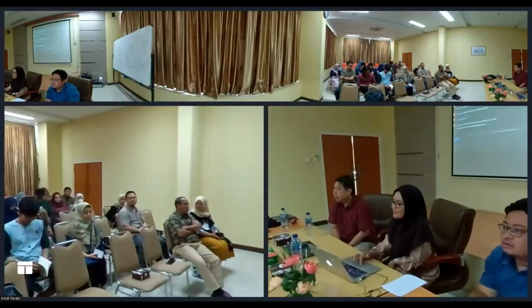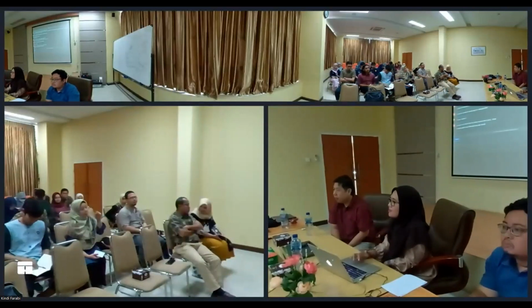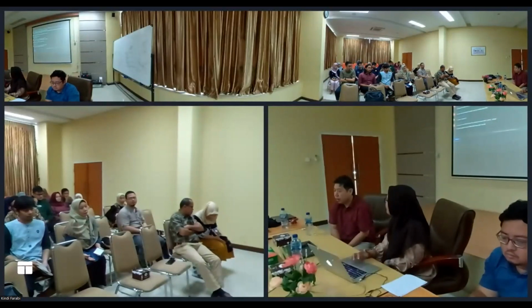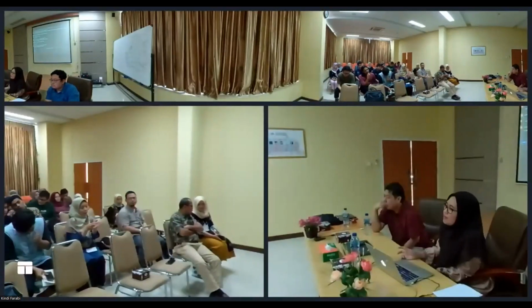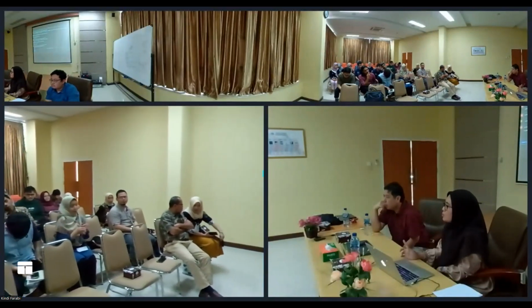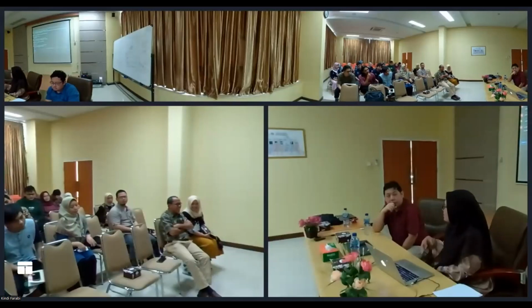I wanted to ask: when I run an experiment with mass spec, sometimes I get m/z equal to the exact mass number, not plus H or plus Na. For example, I have a compound whose mass is 100. Then when I measure, I get 100, not 101 or 123. Why?